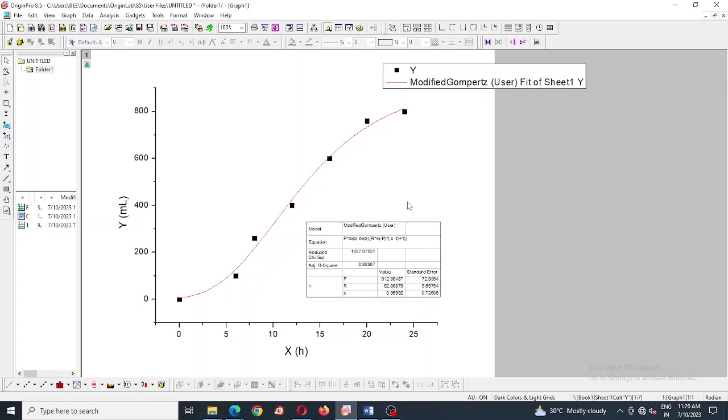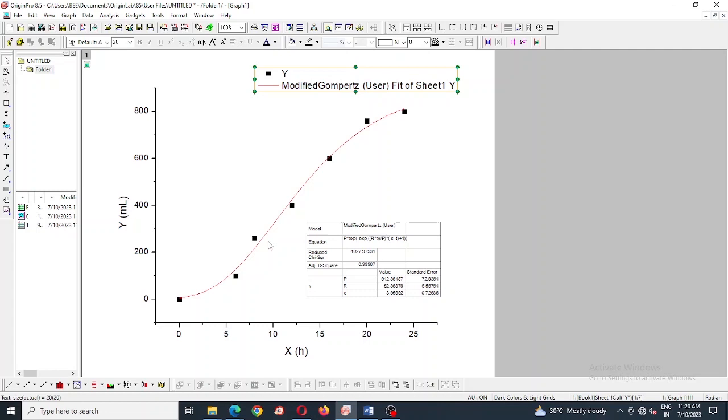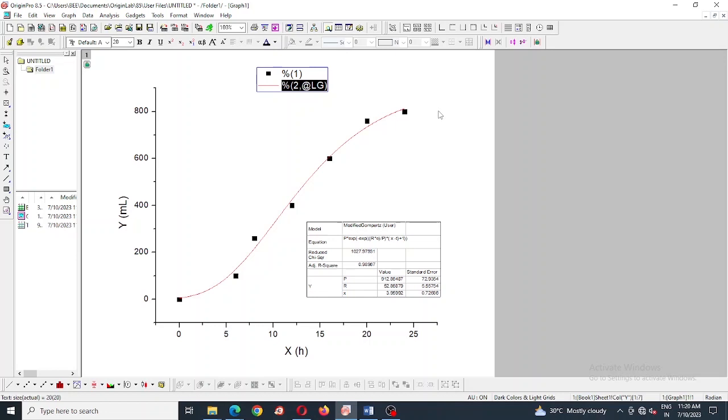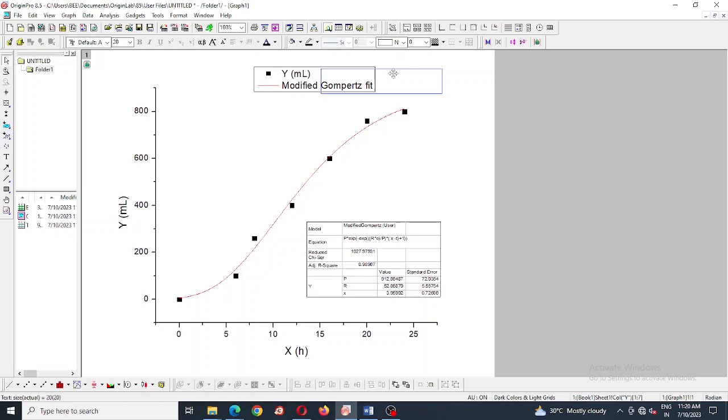Now I am going to export this. Also I can clear those contents and edit for writing purpose. Here I have written modified Gompertz and given the unit of Y. It's here and next I am going to export it.